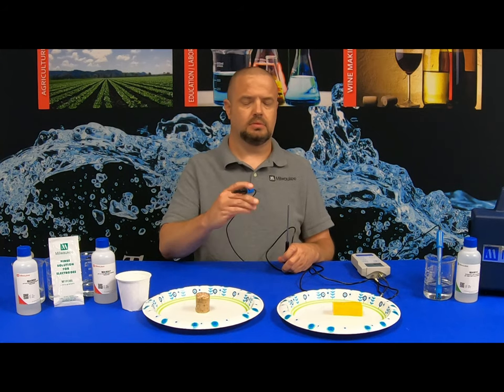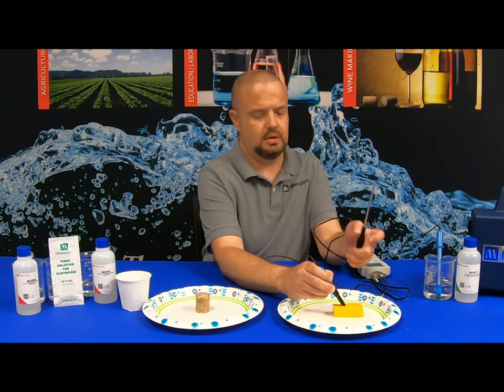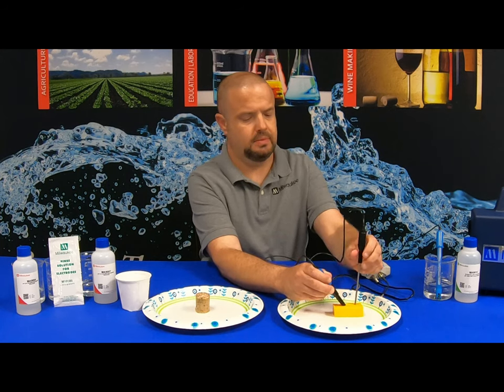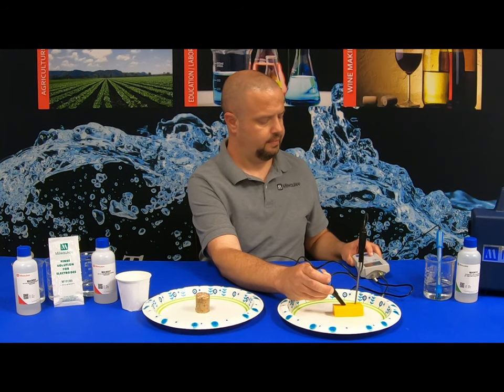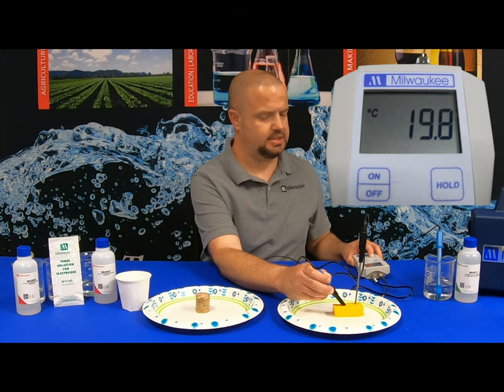Let's now test the pH of sharp cheddar cheese. Take the pH probe and pierce it down into the cheese. We'll also take the temperature probe and do the same thing. Wait for the hourglass to go away in the upper left-hand portion of the screen. The pH of the sharp cheddar cheese is 5.15. Pressing the temperature button, the temperature is at 19.8 degrees Celsius.